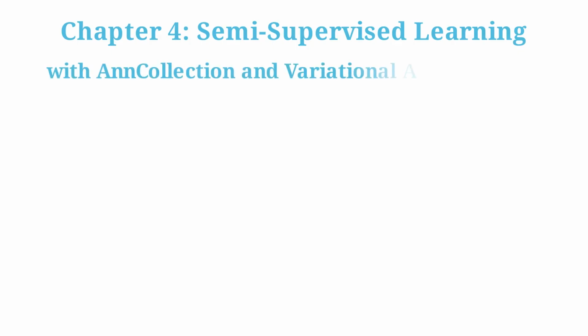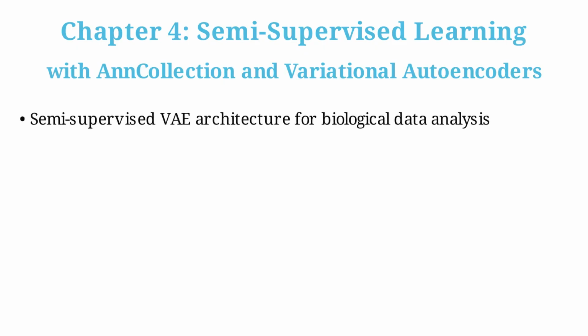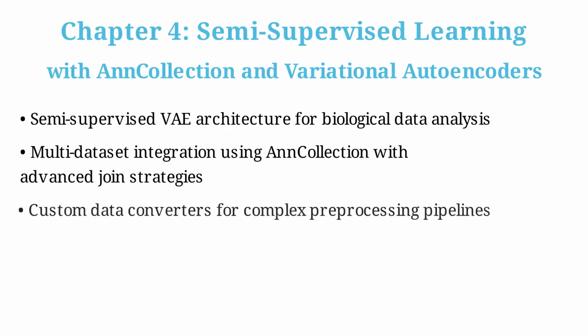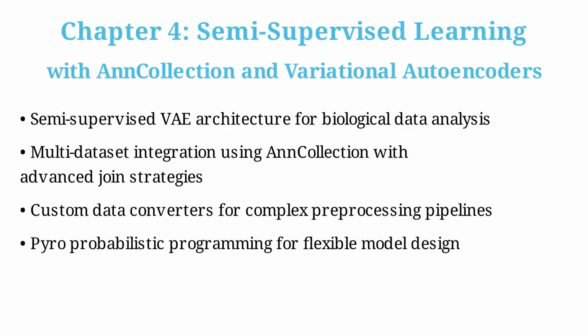Welcome to Chapter 4, where we explore semi-supervised learning with AnnCollection and variational autoencoders. This is an advanced tutorial that demonstrates production-ready machine learning pipelines using Anndata's ecosystem.